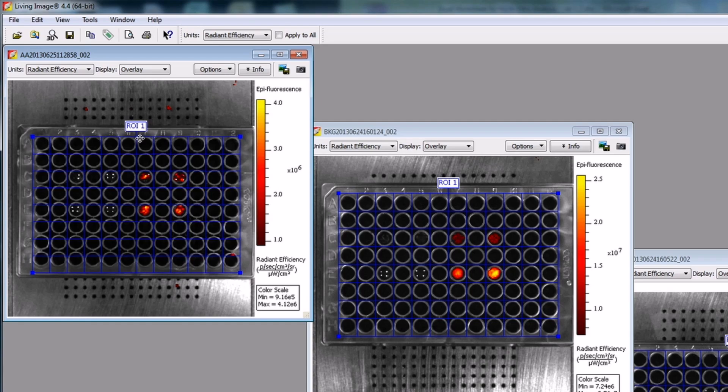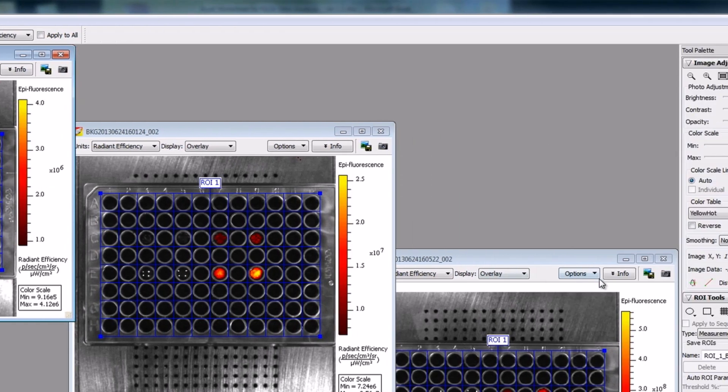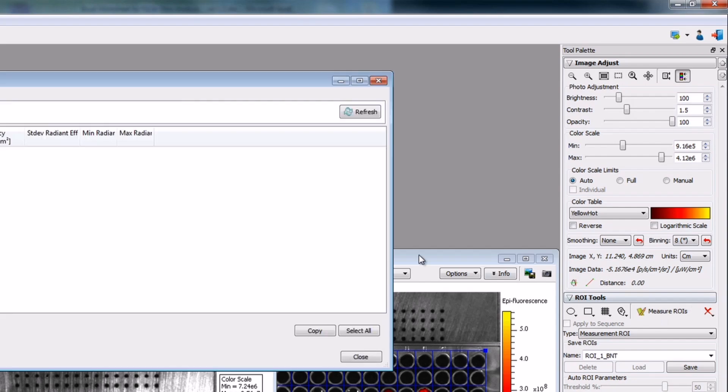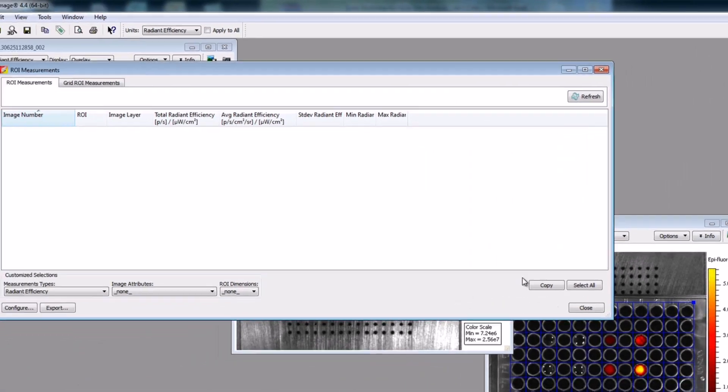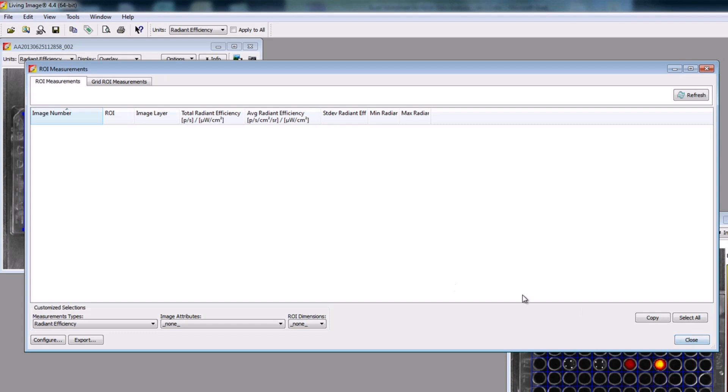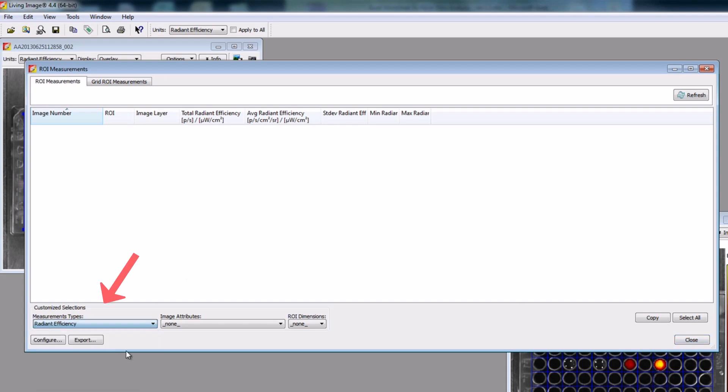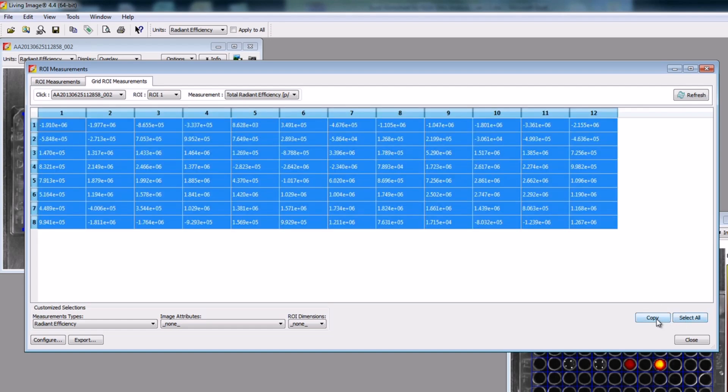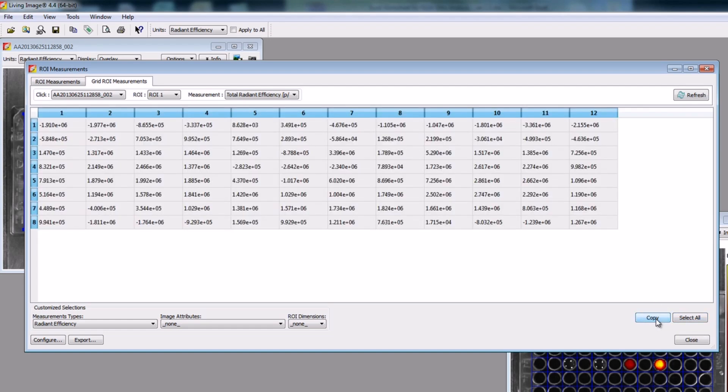Then with the grid ROI drawn and properly placed, click on the Measure ROIs button in the ROI Tools tab. The ROI Measurements window will open. To see quantitative fluorescent data, select Radiant Efficiency from the Measurement Types pull-down menu. Click on the Grid ROI Measurements tab. Your quantitative data will now be displayed in a grid format that mimics the well plate. To export this data, click on Select All and Copy in the lower right-hand corner of the window. The data is now copied to your clipboard and can be pasted into Excel, PRISM, or other spreadsheet program.